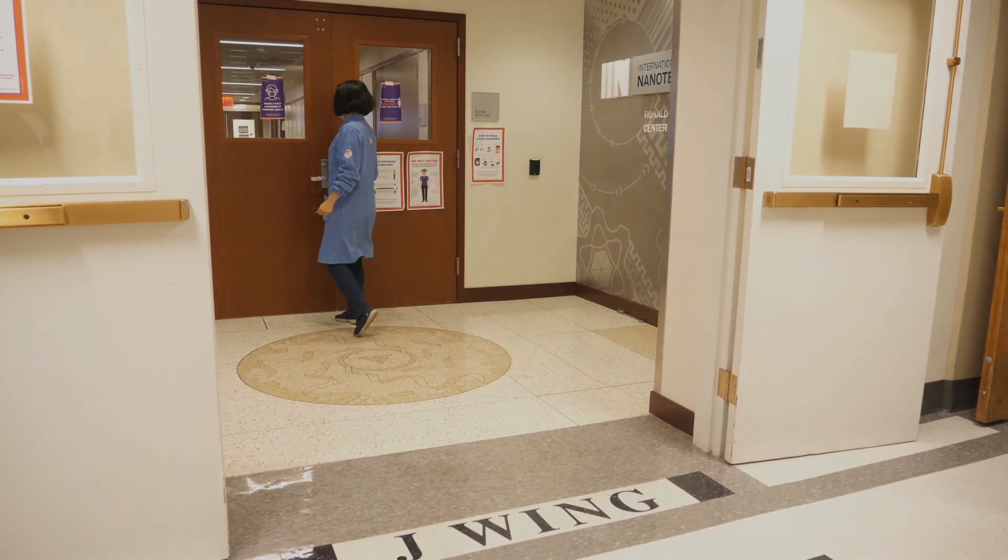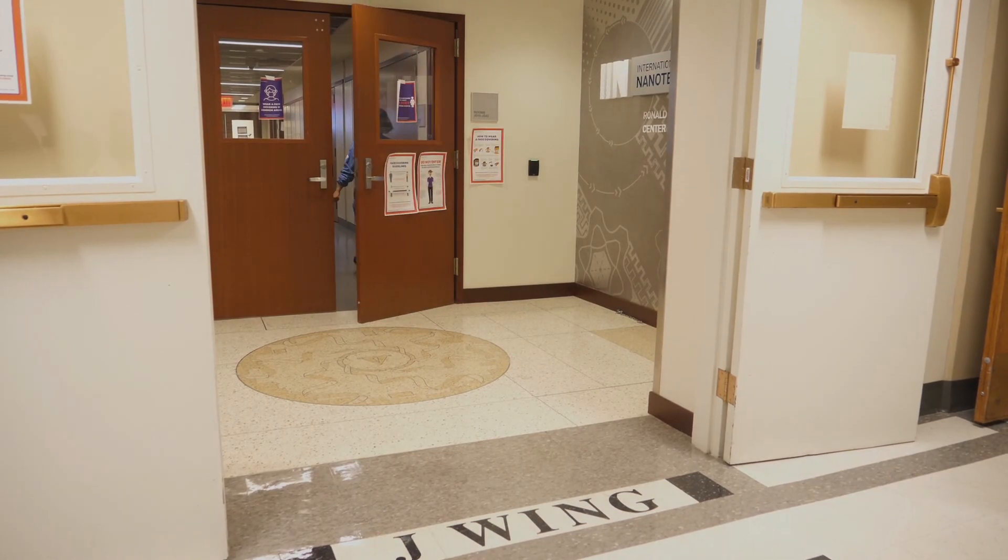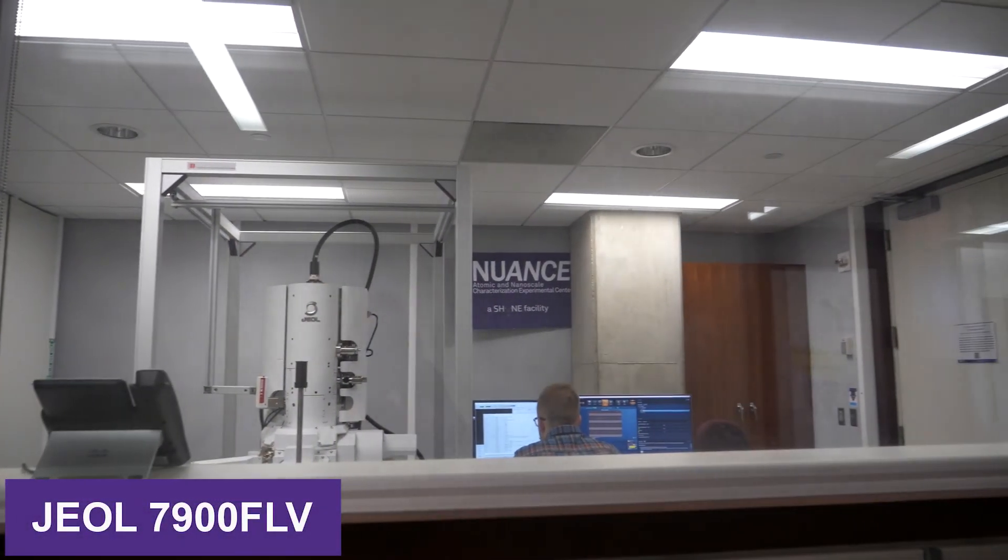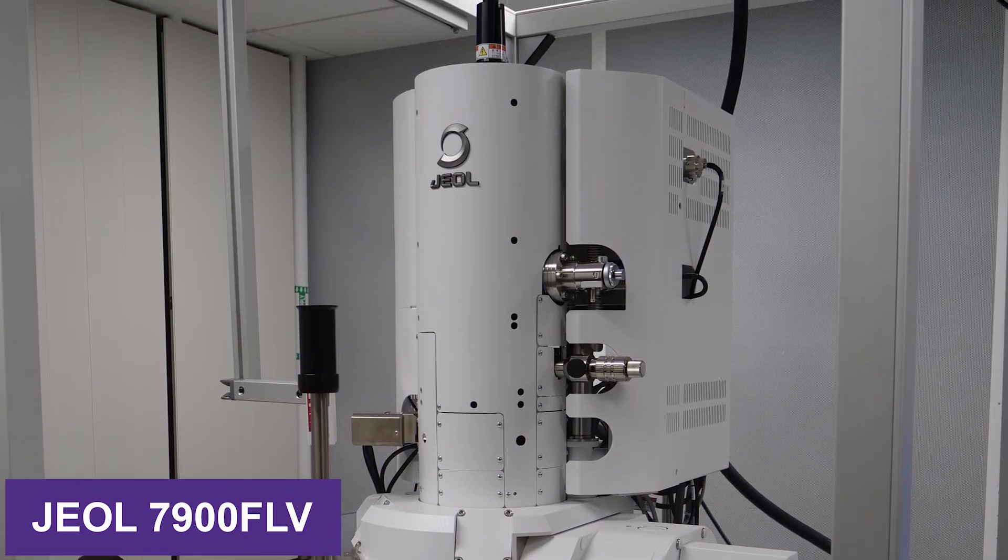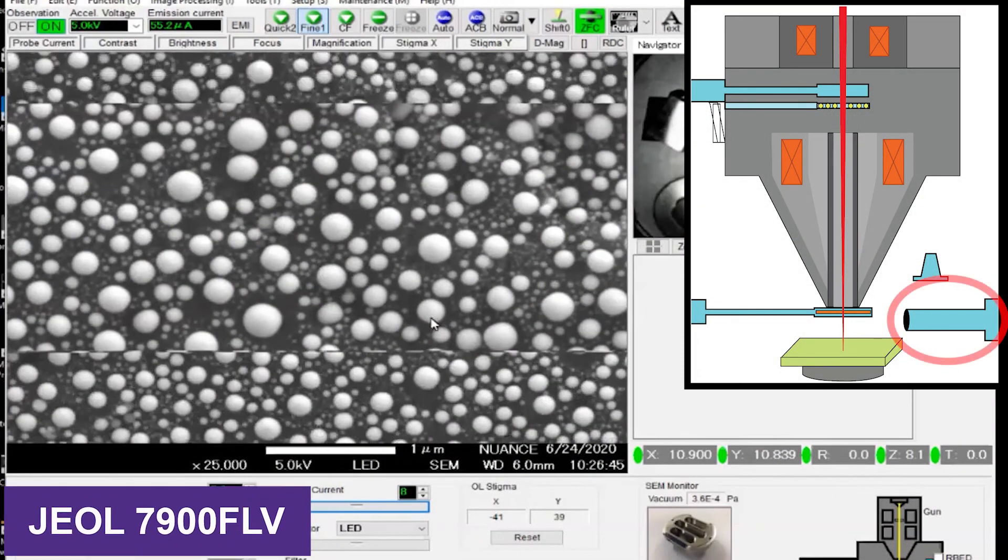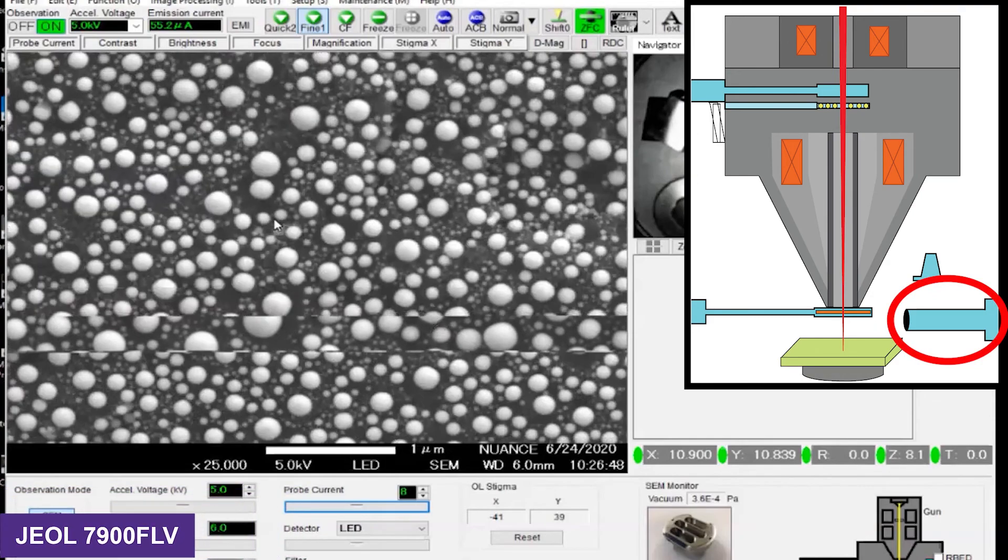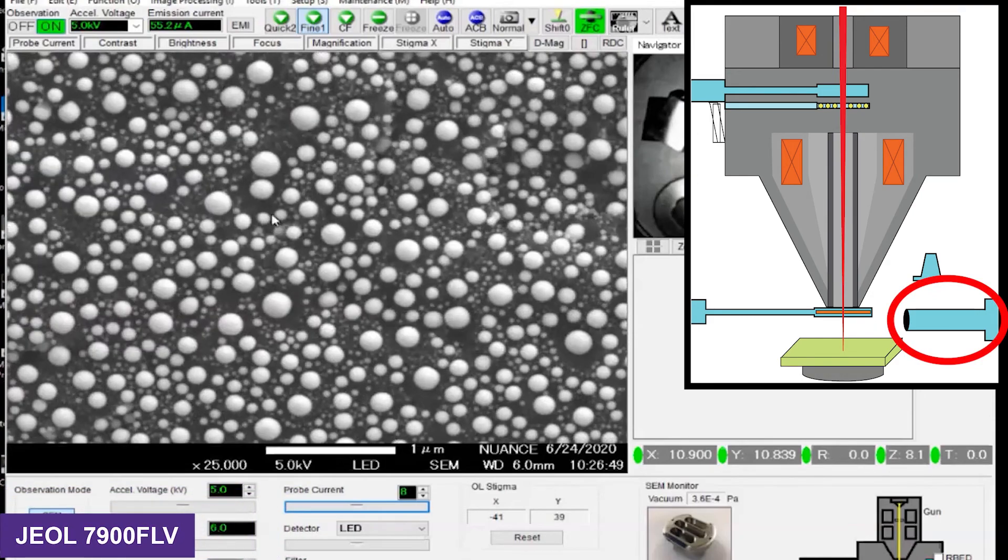The last SEM on this tour can be found on the ground floor of the J-Wing. This is the JEOL 7900FLV, the newest high-resolution microscope in the lab. Like all of the other SEMs, this also has a lower detector. This is great for highly topographic samples.